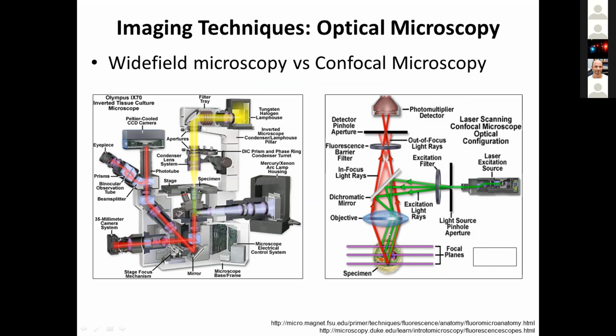This is really a great advantage, and basically by changing the pinhole, we can change the resolution. But of course, if we close the pinhole too much, we will restrict a lot of light, and we will be unable to see anything from the sample. Considering that we have the pinhole, of course, we will be acquiring a point, which is called the point spread function.